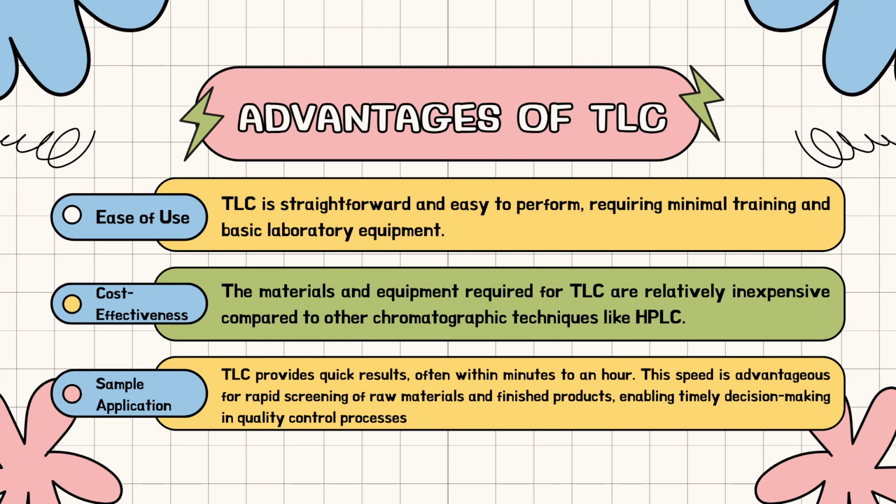What are the advantages of TLC? First is ease of use. TLC is straightforward and easy to perform, requiring minimal training and basic laboratory equipment. Second, cost effectiveness. The materials and equipment required for TLC are relatively inexpensive compared to other chromatographic techniques such as HPLC. And lastly, speed.